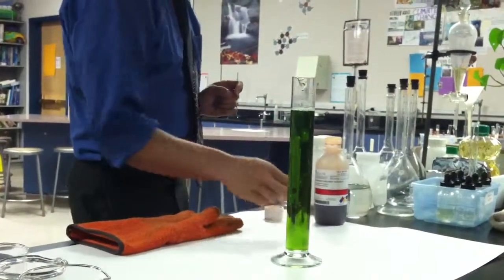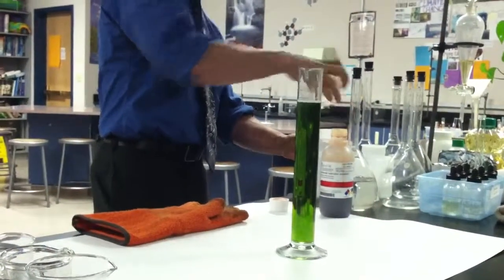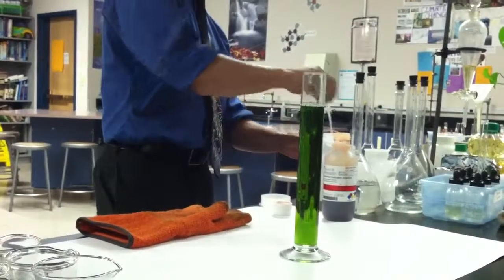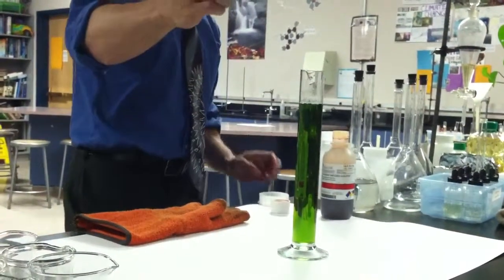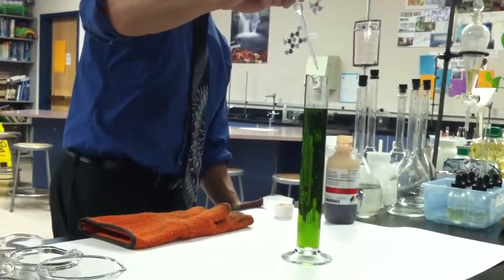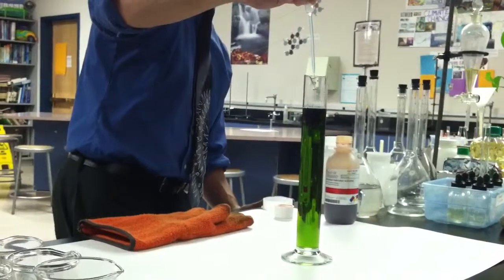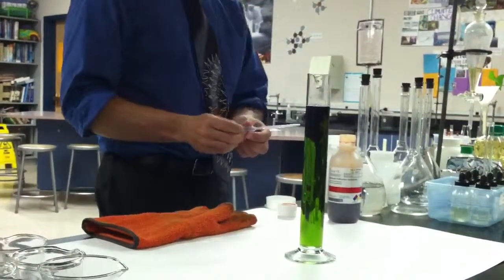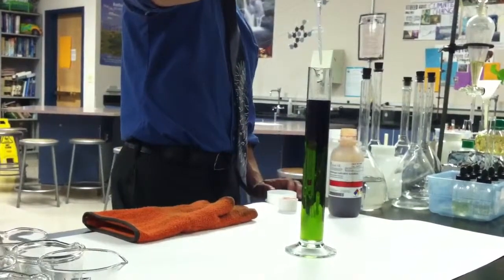Okay, so now what we're going to do is try to change the color of that by making this solution slightly basic. And I'm going to do that by adding some NaOH to it, and we'll see what color basic solutions are. Okay, so we'll add some drops in there. It does look black, huh?